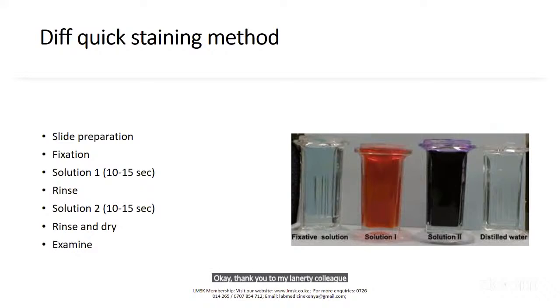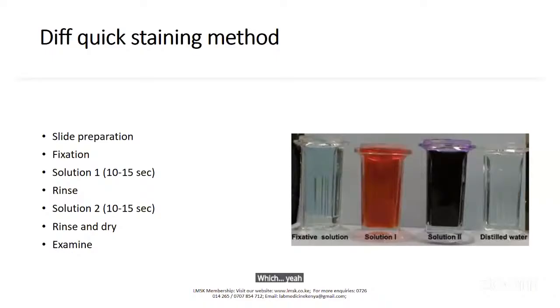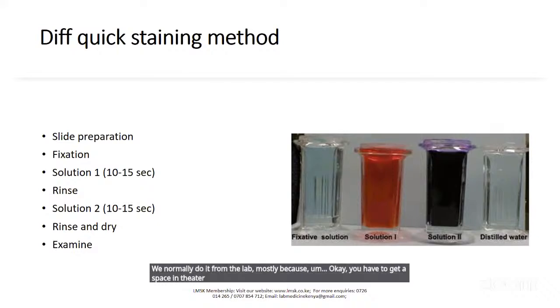My question is, can this procedure be done from theater, for ROSE, results on site? For the Diff-Quik, yes, we do it there. For the frozen section, we normally do it from the lab, mostly because you have to get a space in theater and carry your cryostat to theater.